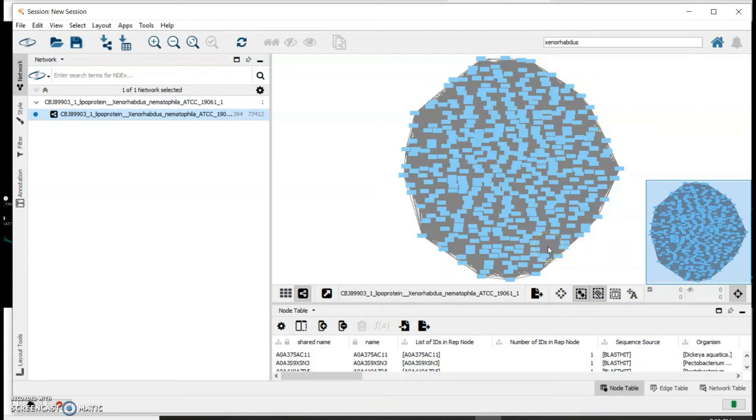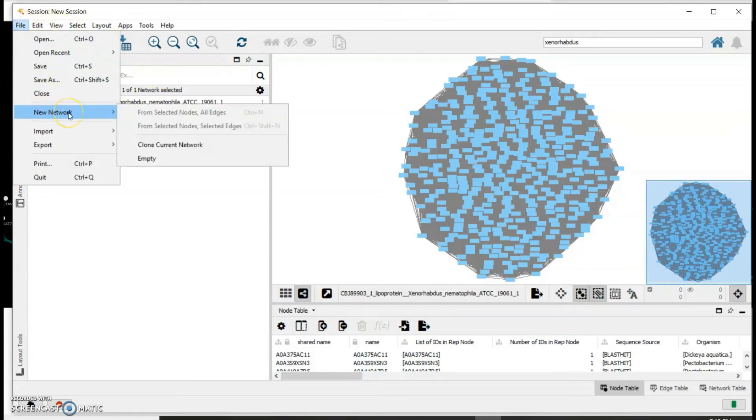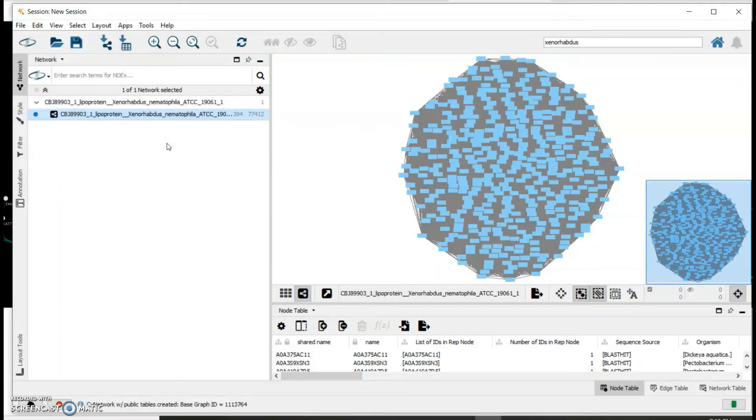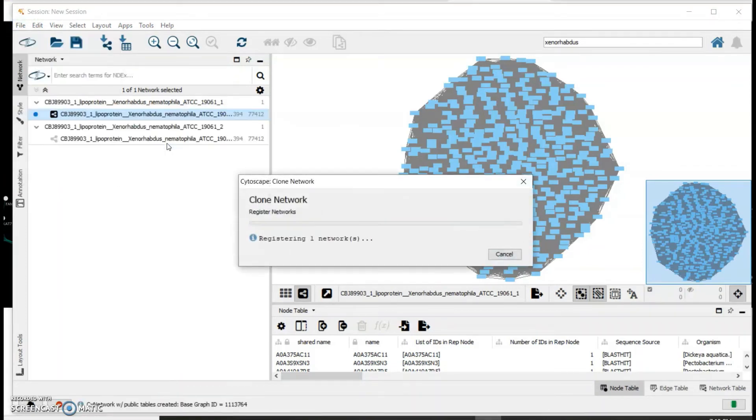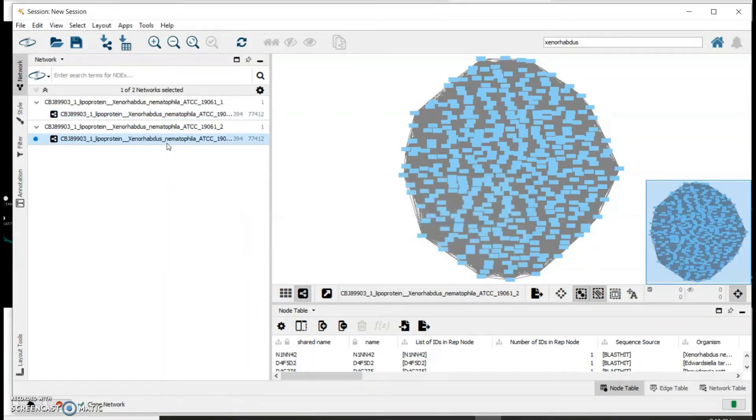Since I want to separate nlpc homologs from Xenorhabdus species from those in other bacterial species, I need to start adjusting the edges in this network. To do this, we first clone the current network by clicking on the network, and then File, New Network, and Clone Current Network. This will generate a copy of the network that we can play around with.